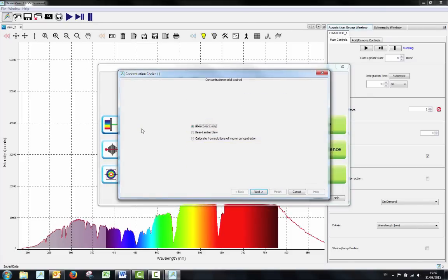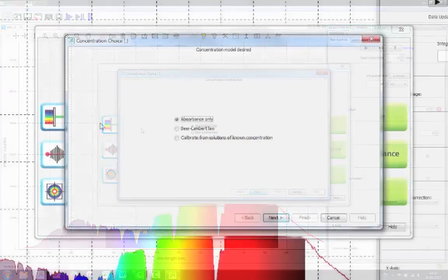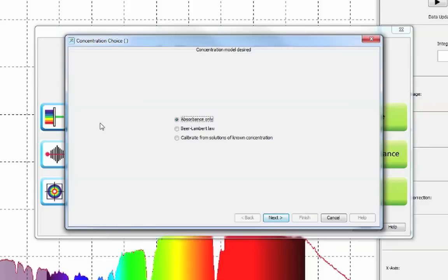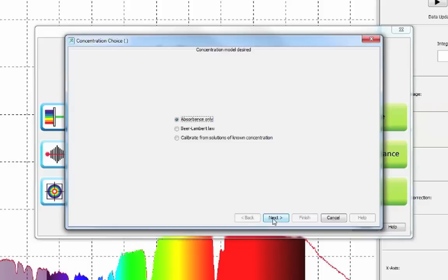You will be presented with the following choice. The bottom two refer to making a calibration curve for the absorbance at different concentrations of your sample. For this video we will be looking at taking a simple absorbance measurement using just one sample. So we will select the absorbance only option.